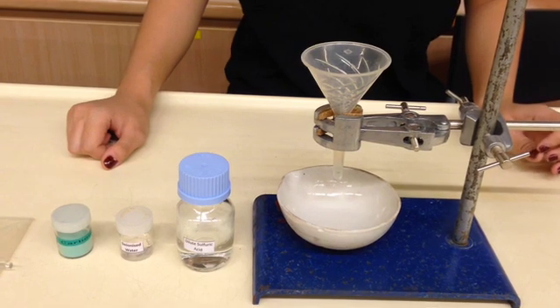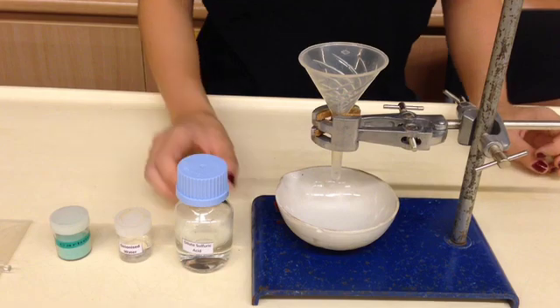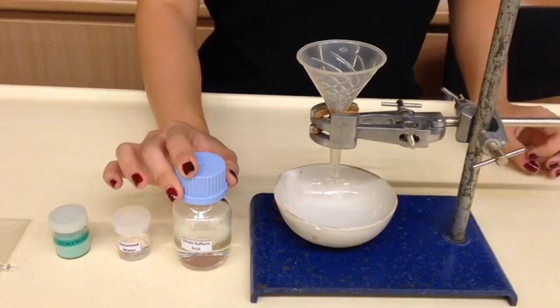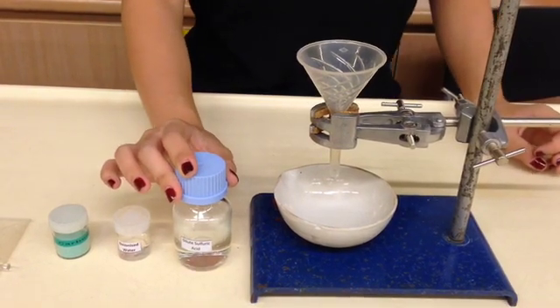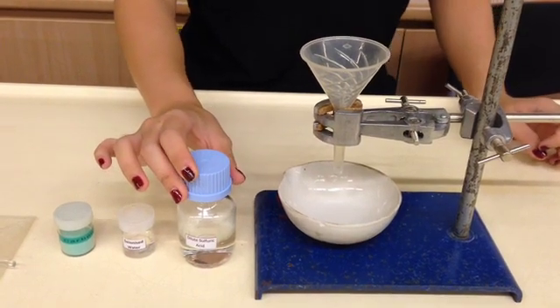The first one is titration, the second one is precipitation, and the third one is what we will be doing now. So when we prepare a salt like copper 2 sulfate, copper 2 sulfate is actually a soluble salt, as you should know by now based on the solubility table.